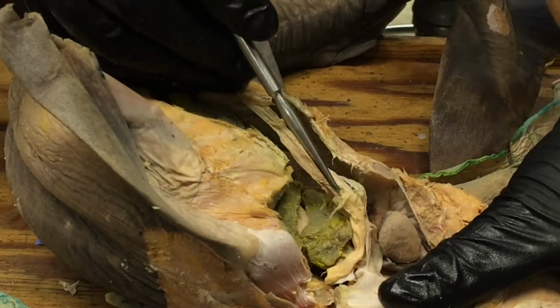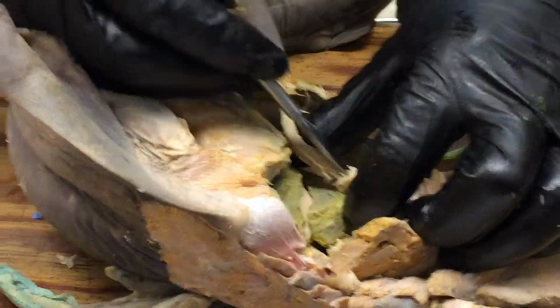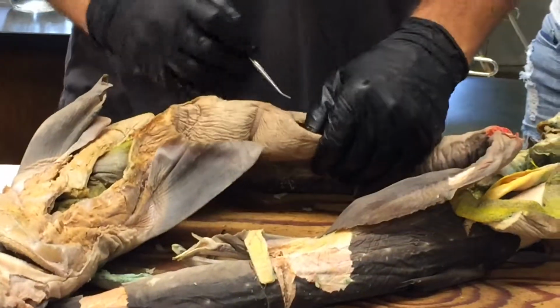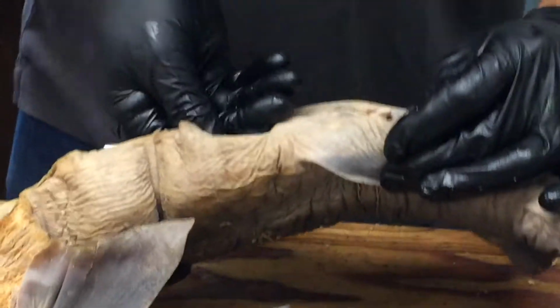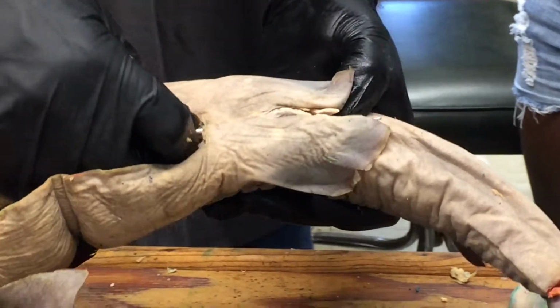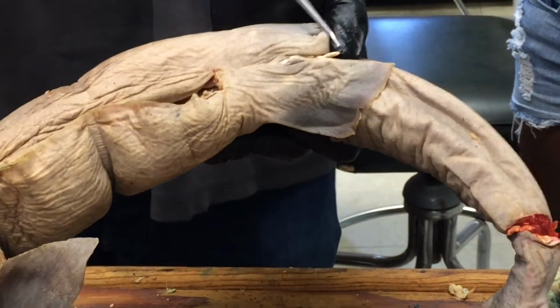If I go the other direction, this is going to be way too difficult. But let's see if I can manage. Oh, yeah, there we go. So the uterus, and the uterus will empty out eventually into the cloaca. So I can pass a probe down the uterus and it pops out there. We also have in the cloaca the urinary papilla.